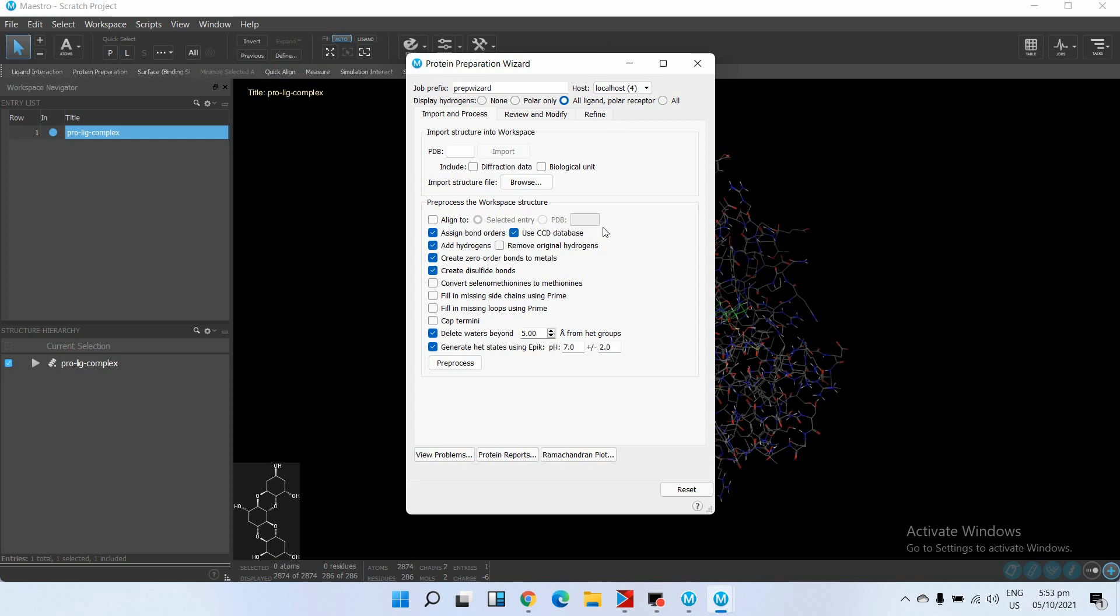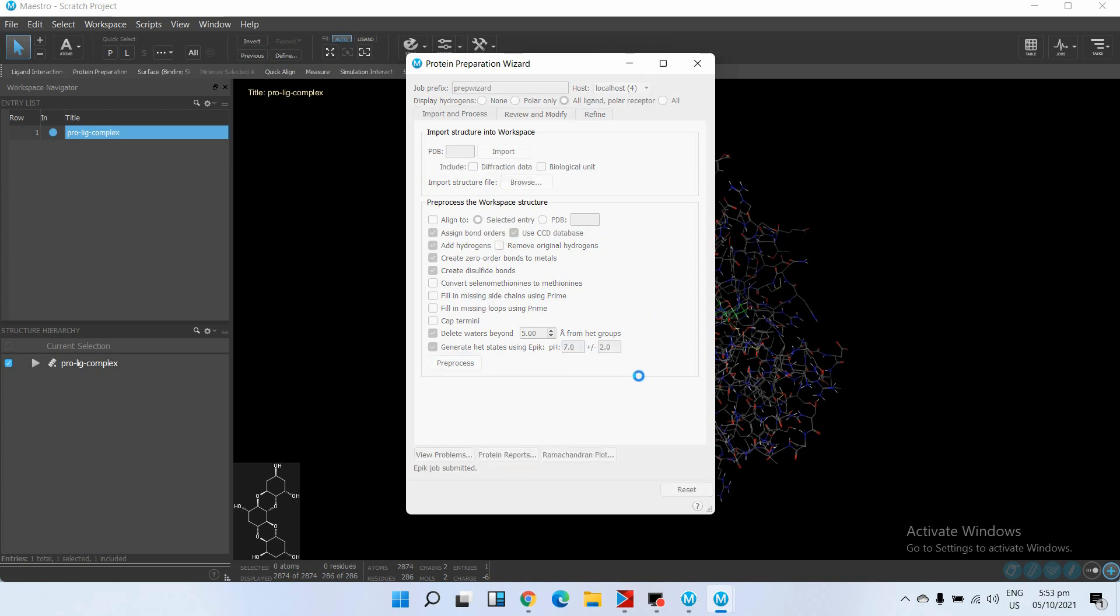So we will go with these parameters and just click on Pre-process, and this will start the pre-processing of your protein and ligand complex.